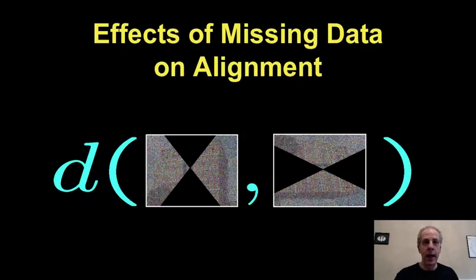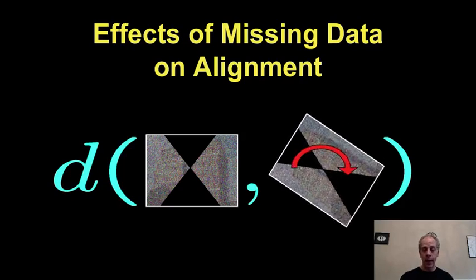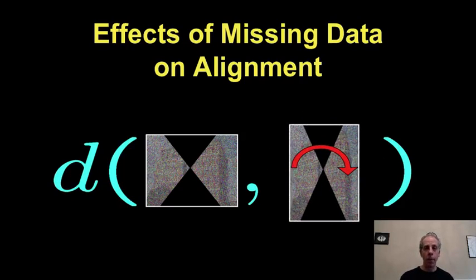We take any two images, two projections or 3 dimensions, depending on where we are working, and how do I know if these two are aligned or not? That's the first thing we need to do, to define a distance. We are going to allow the images to rotate and also translate later on, and we want to be able to say, hey, keep rotating, stop.